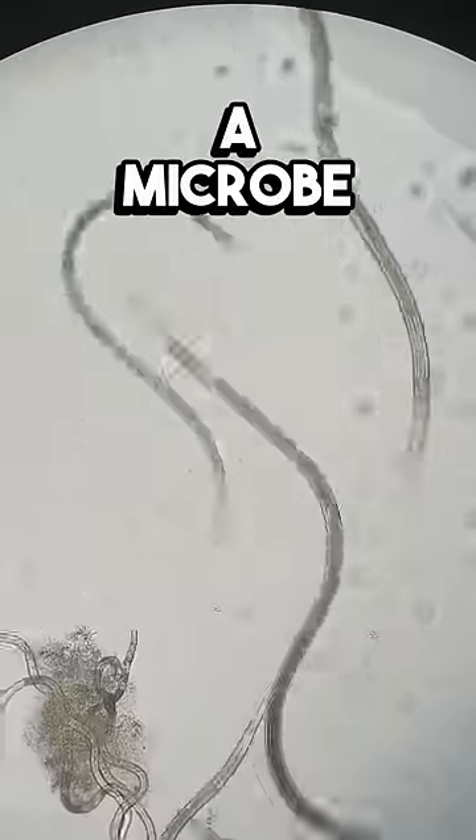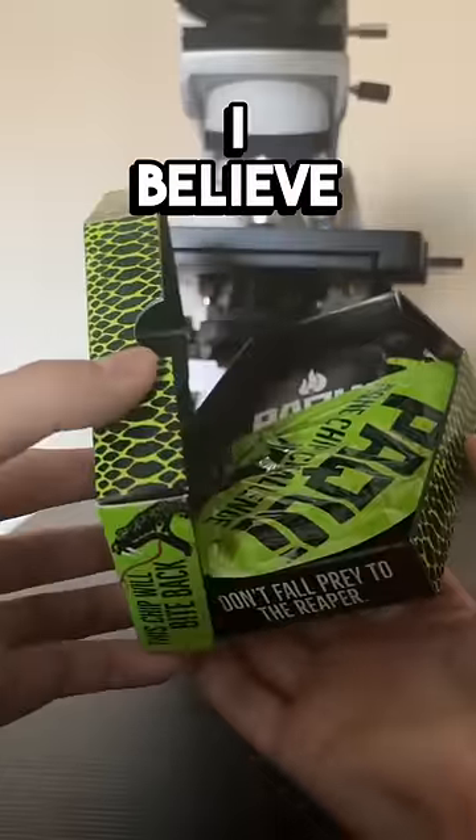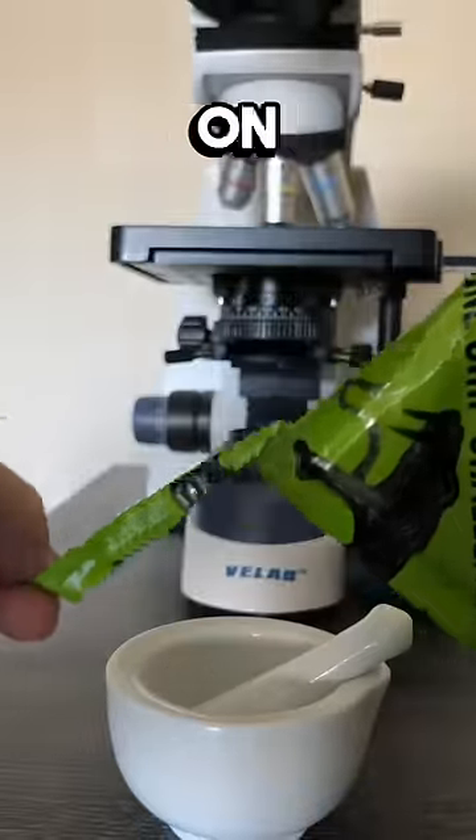Can you do the one chip challenge on a microbe to see what happens? I've only seen humans eat this before, and for what I believe is the first time ever, you're going to see what happens when it gets put on a microbe.